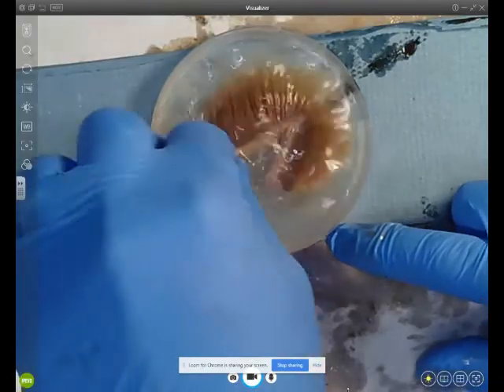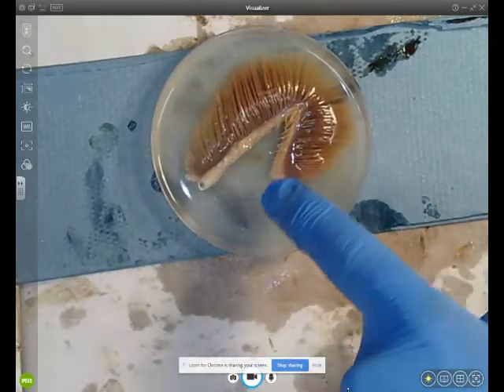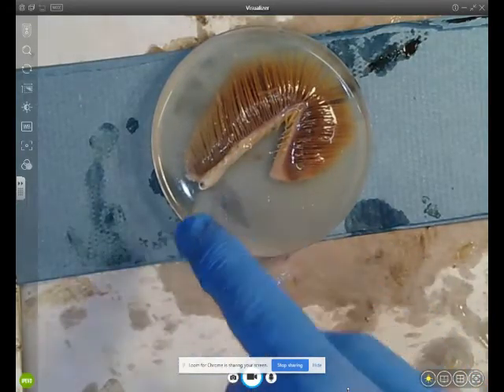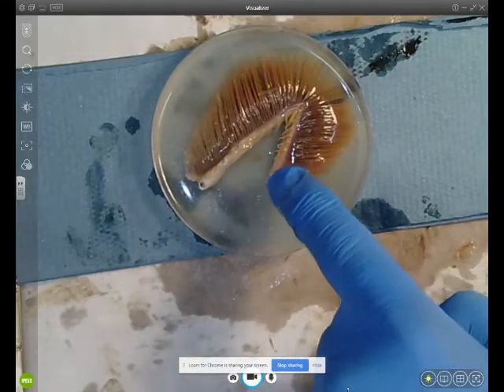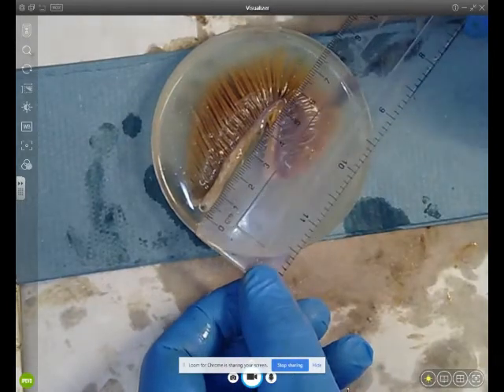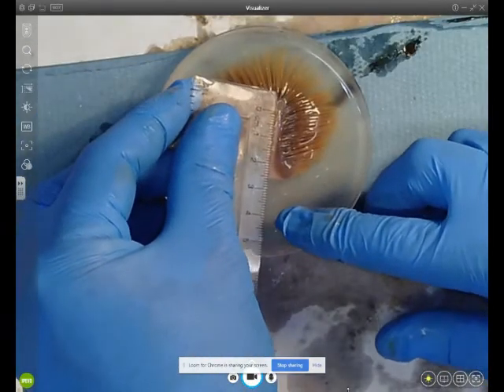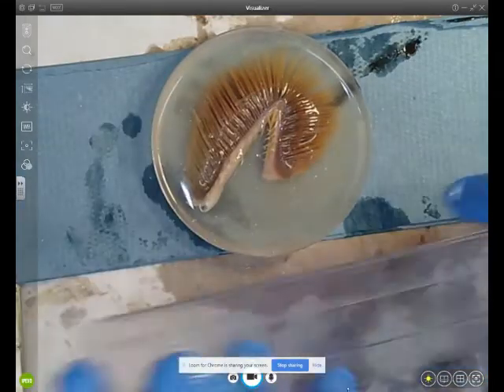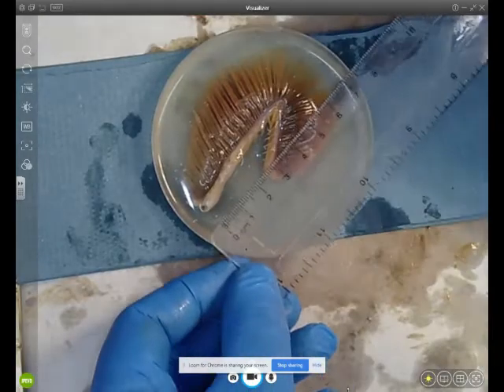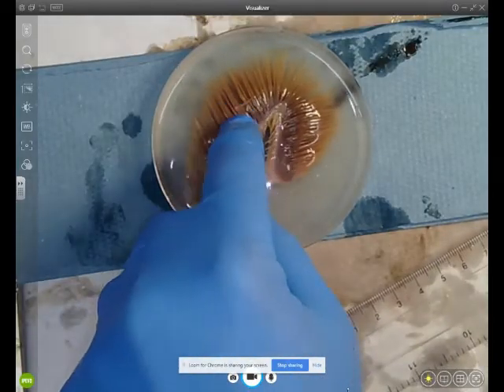You can also see on the inside of the gill arch the gill rakers, which are used to filter things like plankton. The gill filaments — there are many of them. You can measure them using a piece of string or a ruler. The gill arch is around 50 millimeters for one part and about 25 millimeters for the other, so about 75 millimeters in total length. Measuring individual gill filaments is quite difficult with a ruler, so I suggest using a piece of string.